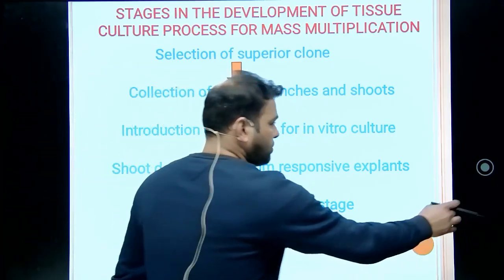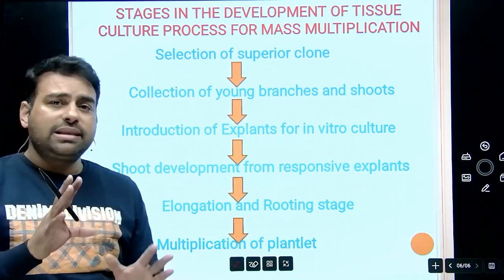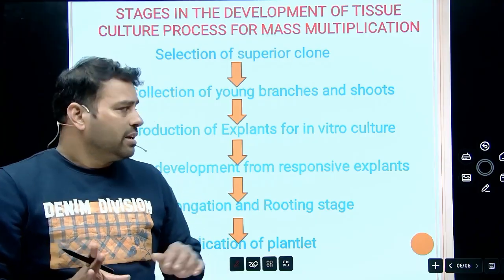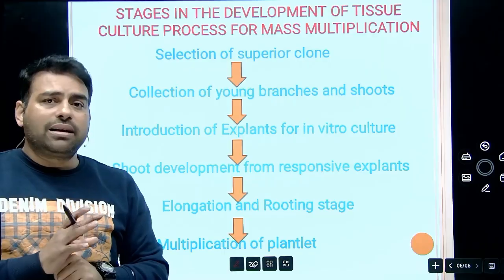Selection of superior clones is a very important step on which the quality of the end plant depends.